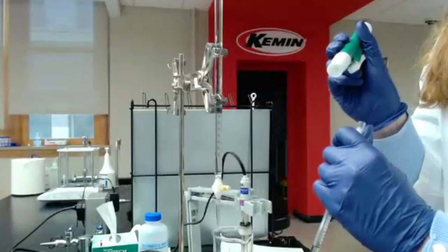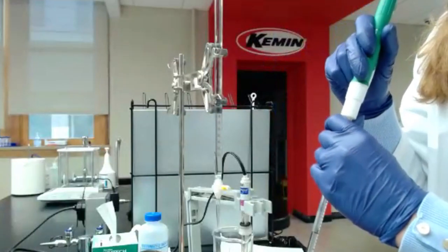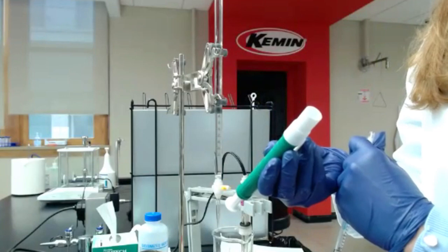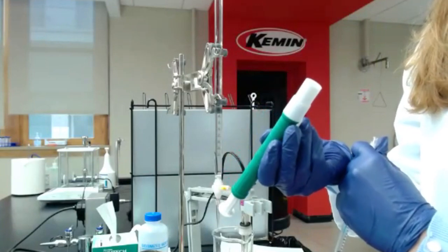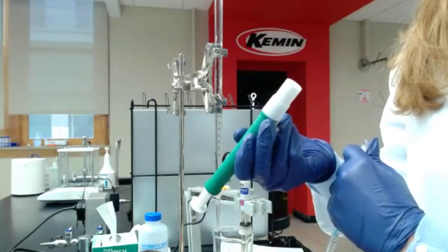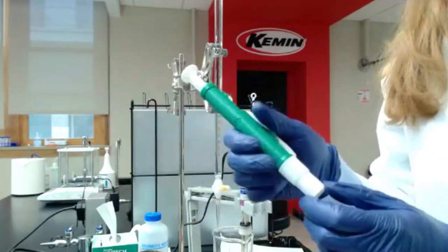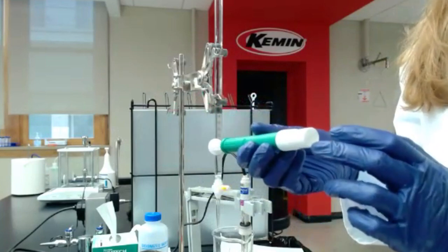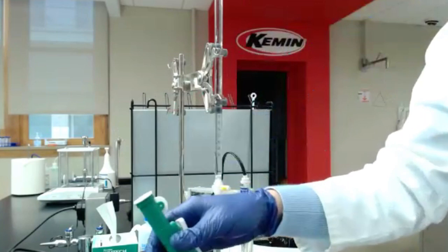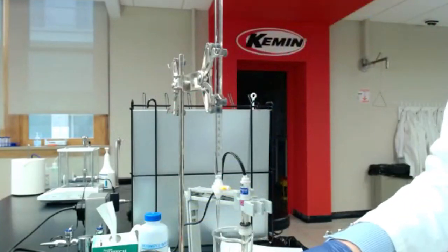Once you're done, you can remove the pump, because if you keep the pump on the pipette and you turn it that way, that's where you're gonna get juice into your pipette. Juice is really sugary, really sweet, and that can lead to a stuck pump at some point. So make sure you don't have juice getting into the pump. Always use that pump straight. All right, so you can put that on the side.